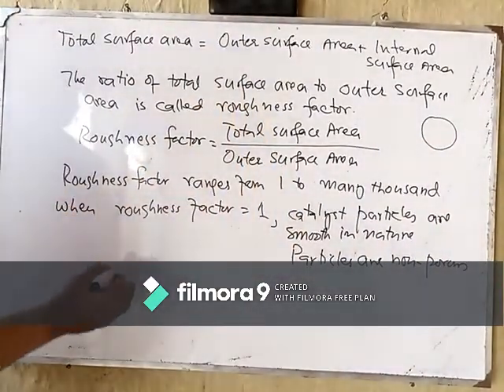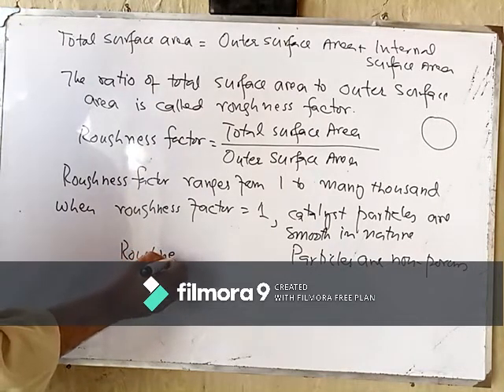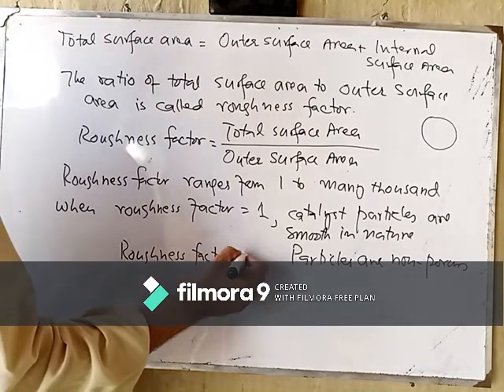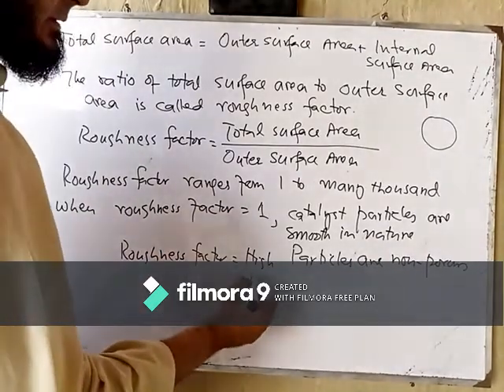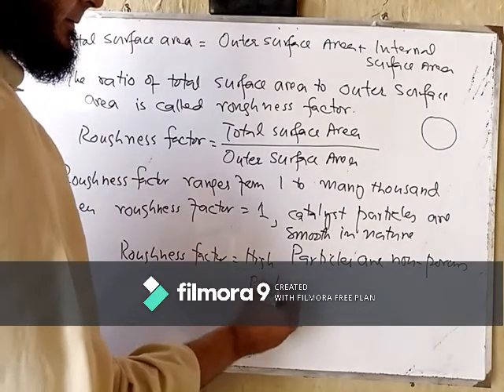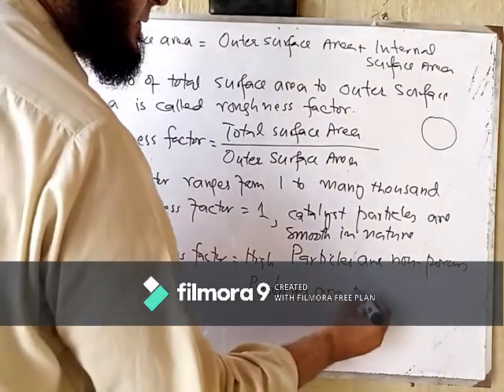When roughness factor is high, it means the particles are rough or the particles are porous.